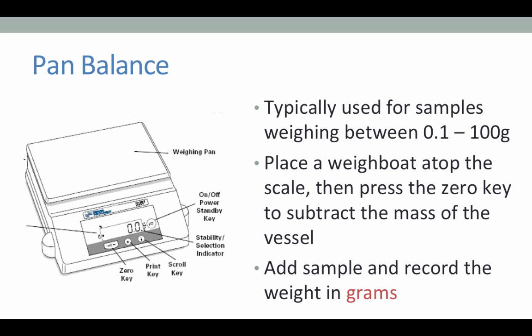When we use a pan balance to weigh an item, we do not put the item directly on the scale, but rather use a weigh boat. This is a small plastic dish. It weighs very little. It can be used to hold our sample to keep the balanced surface clean. So we'll place the weigh boat atop the scale and press the 0 key to subtract the mass of the weigh boat from the measurement of our sample. We would then add our sample and record its mass in grams using all of the decimal places displayed.